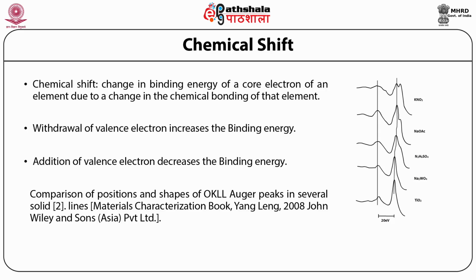The comparison of positions and shape of oxygen KLL Auger peaks in several solids is represented in figure 3.